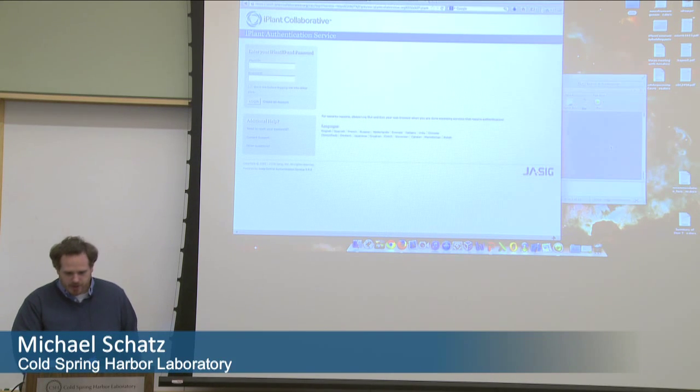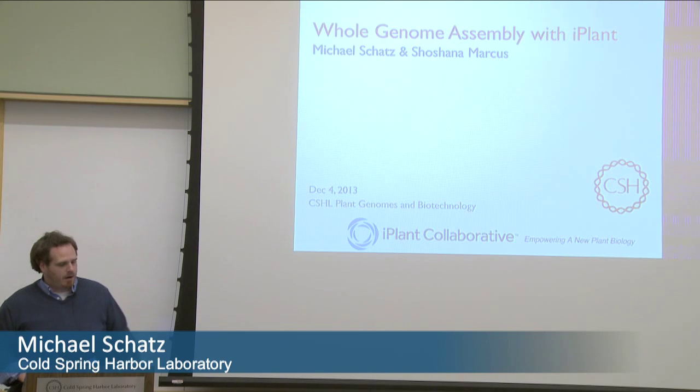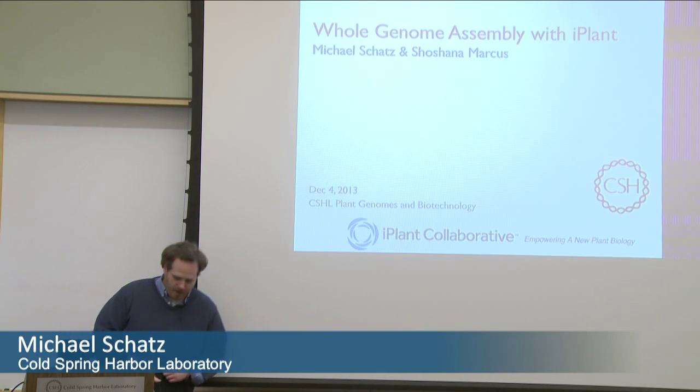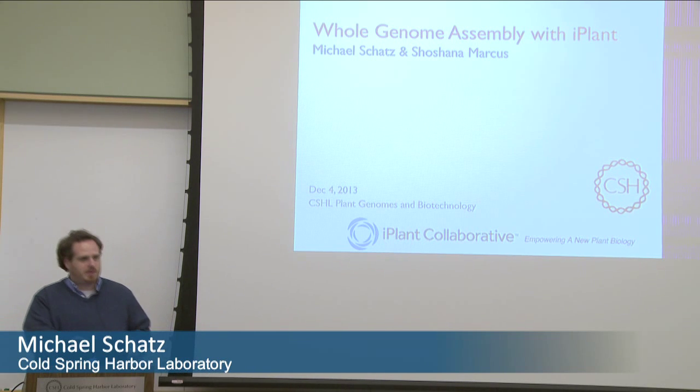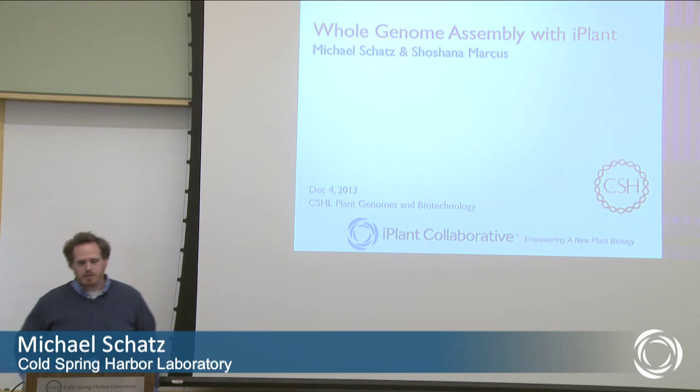My name is Michael Schatz. I'm an assistant professor here in the quantitative biology department. Before I was here, I was at the University of Maryland with Steven Salzberg. Before that, I was at the Institute for Genomic Research, TIGR. So I've been in genomics for more than 10 years, and throughout that time, genome assembly has been a major research interest of mine. I'm going to walk you through some of the algorithms, some of the concepts, and then we'll get hands-on with some of the data.